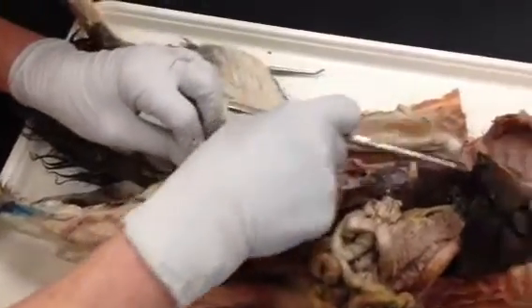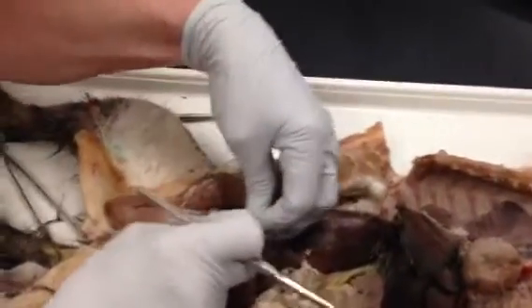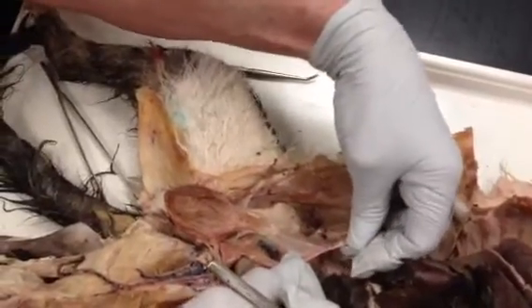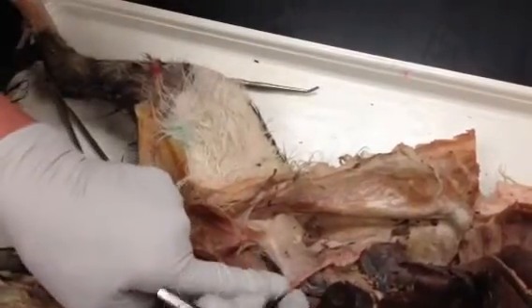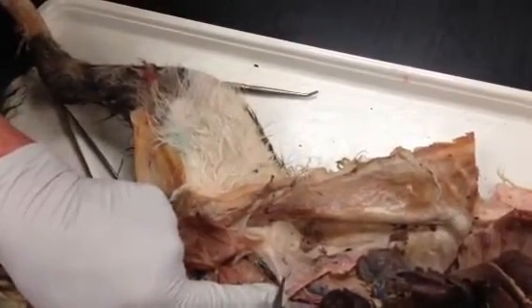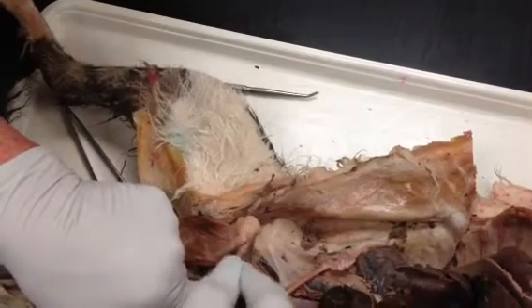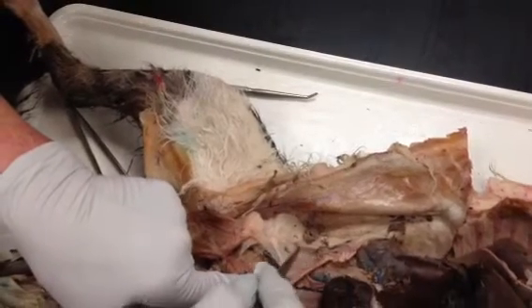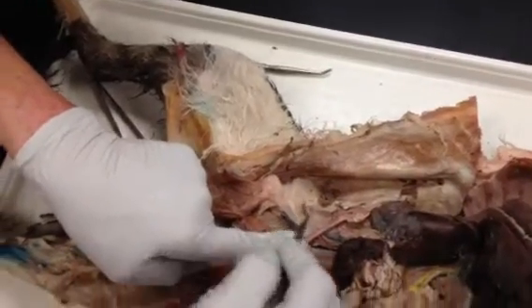What we also have is, if you remember, I was wearing a plastic bag and I had string tying me to the front wall. The plastic bag represented the broad ligament. The string that I had represented the round ligament. This is the round ligament, holding the uterine horn to the anterior wall. The broad ligament holds the uterine horn to the posterior wall, or dorsal body wall.